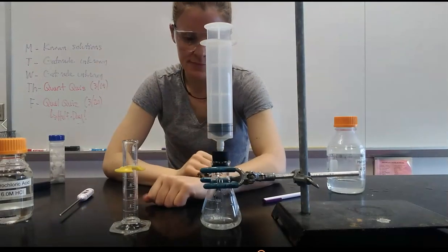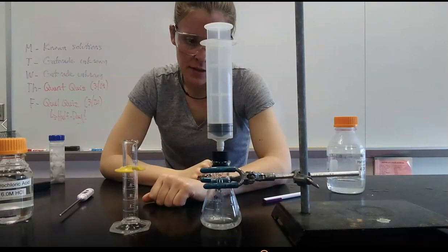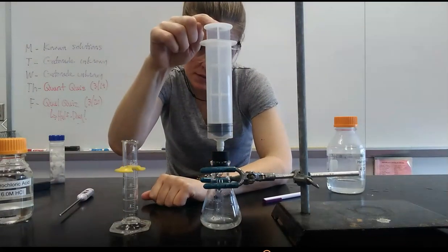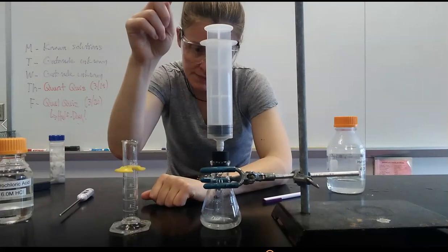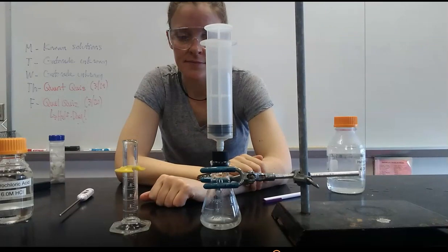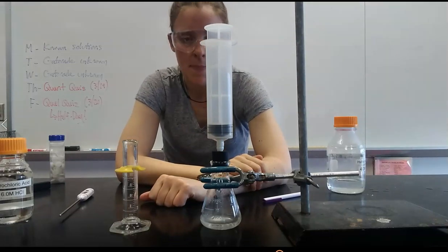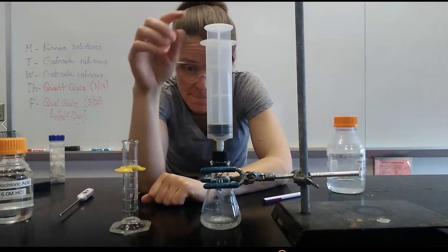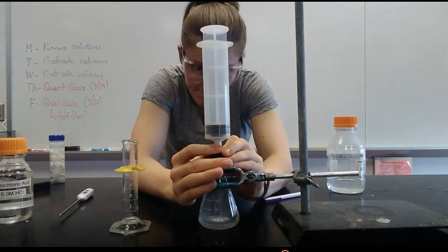I might need to move the plunger just a little bit and every 10 seconds I'm going to push the plunger down a little to try to overcome friction and you can see that it's bounced back up. At the 15 second mark I'm going to record the volume of gas in that syringe. I'm going to keep going. Every 15 seconds I'm measuring it. Make sure that's in there tightly.